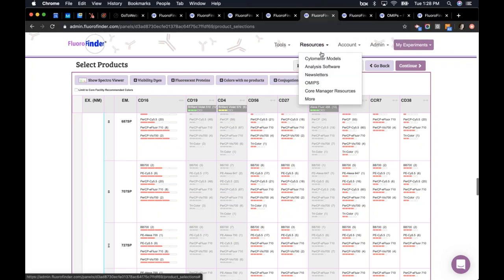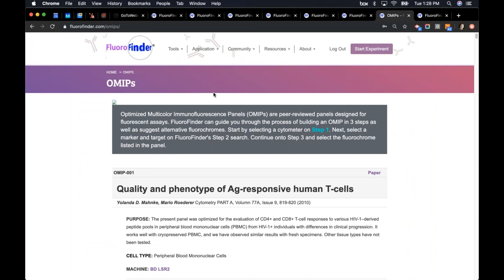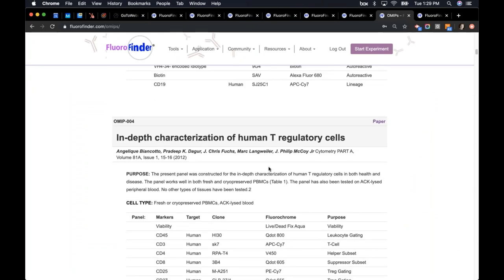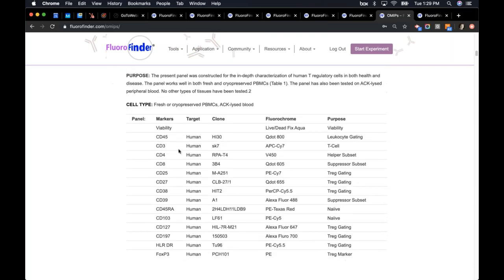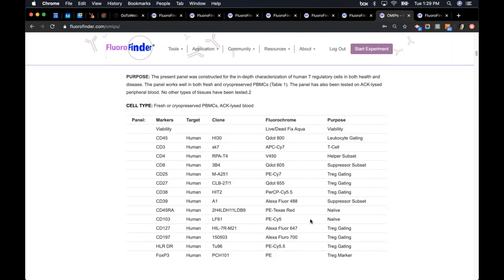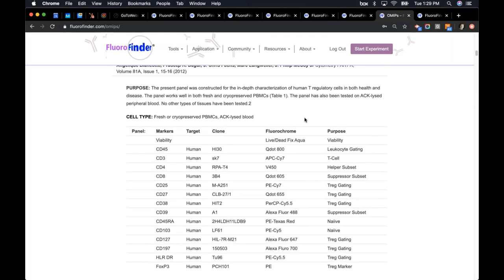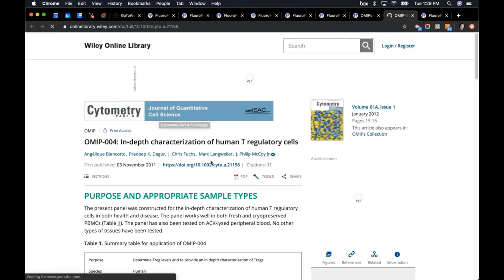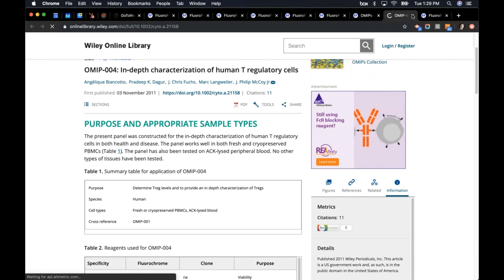That's the main functionality of FluoroFinder. In the resources page, there's information on cytometer models, analysis software, historic newsletters, and core manager resources. In particular, the OMIPS page has been one of our most appreciated features. All the published OMIPS are accessible directly from FluoroFinder. If you happen to be doing an in-depth characterization — like human T regulatory cells — on a specific machine, you can use an OMIPS as a starting point for your panel and make adjustments from there.